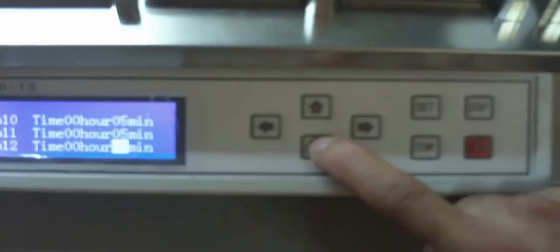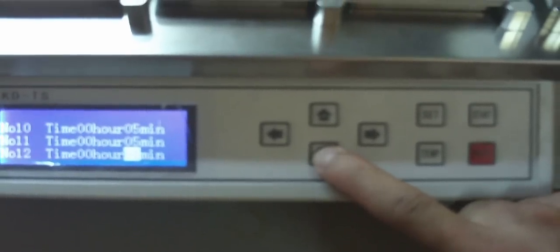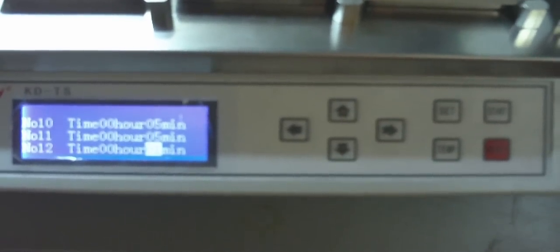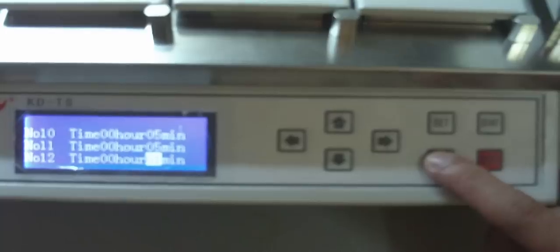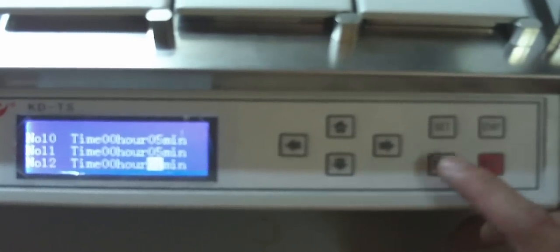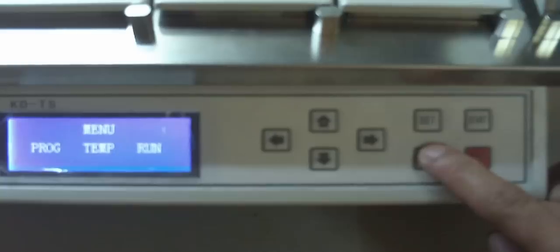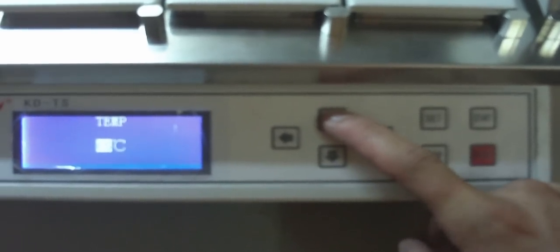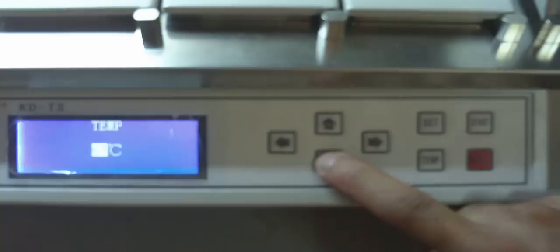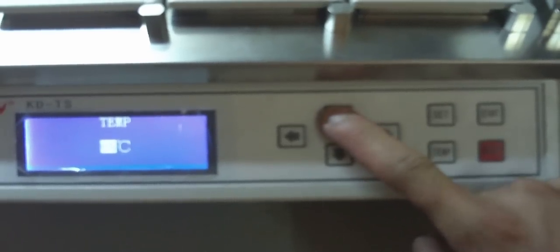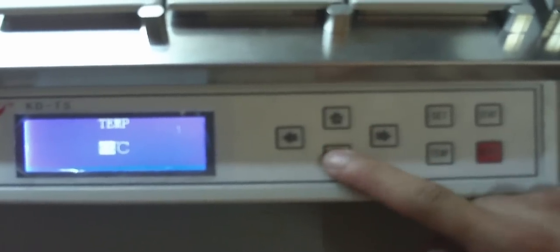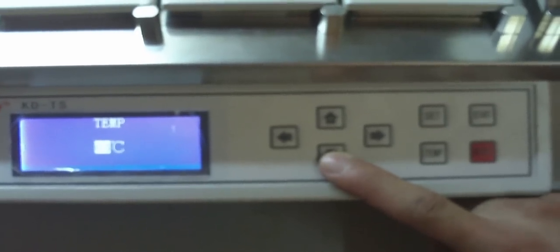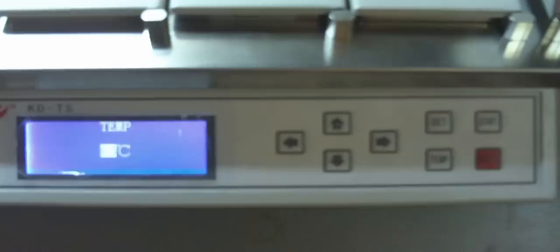Press the TEMP key to enter the temperature interface to set the temperature of the wax tank. Press the up and down keys to adjust the temperature of the paraffin tank from room temperature to 99 degrees Celsius.